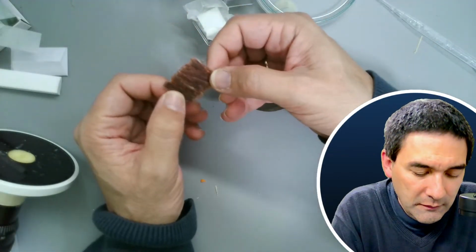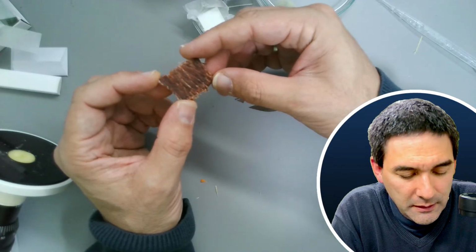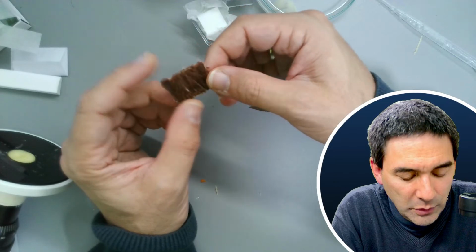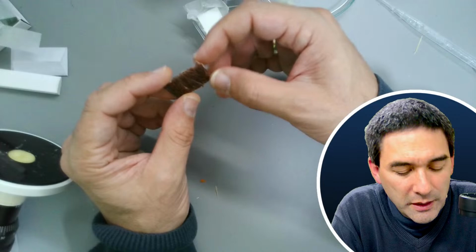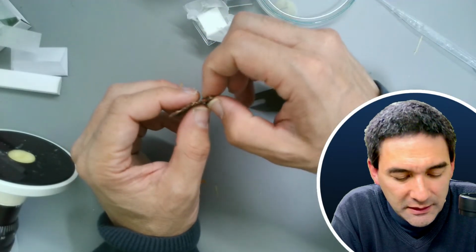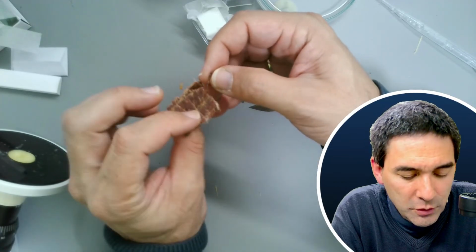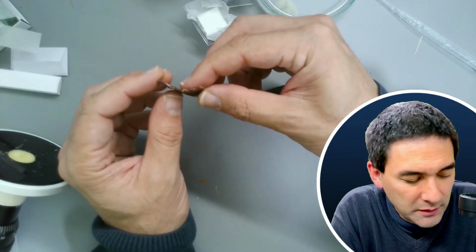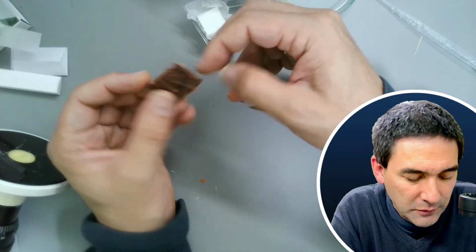Ah, look. If you just look at the fibers, if I am able to soak it in water, I think I'm not even going to cut it. I think it's difficult to be cut. I think what I'm going to try to do is simply separate the fibers like that, hoping that then I'm able to see maybe the individual meat fibers. I wonder, am I able to cut this or not? I think this is going to be too difficult.